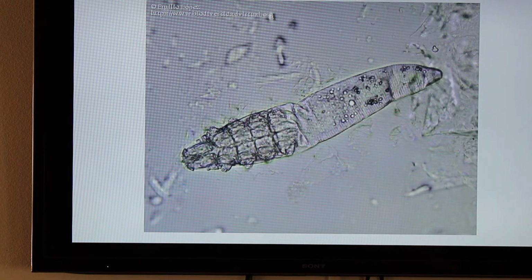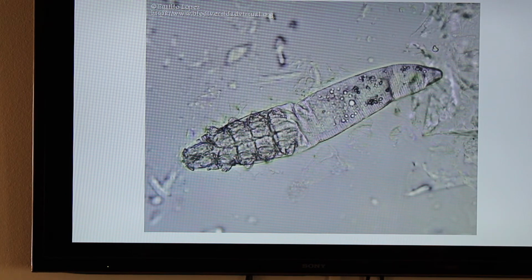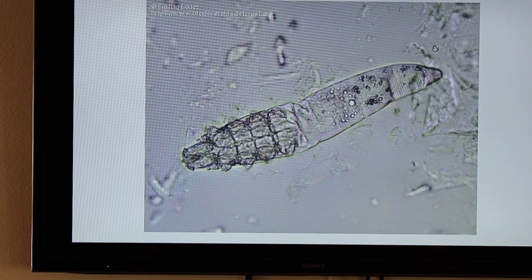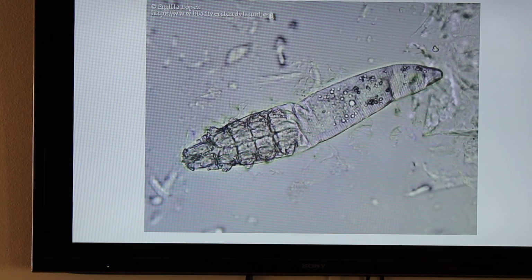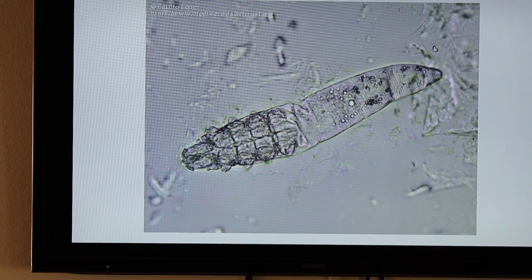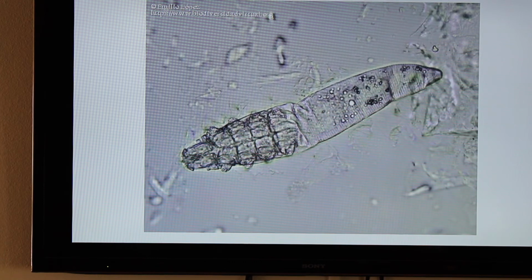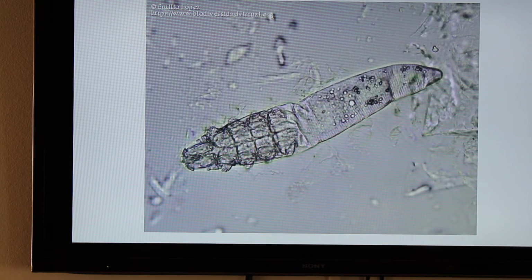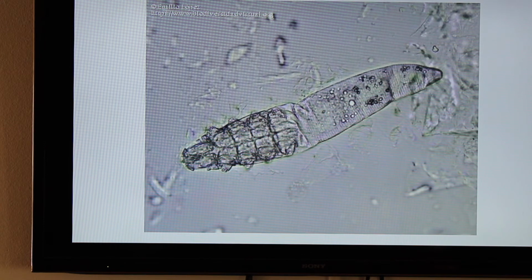This little guy here, it's alligator shaped, is a Demodex. We do have to do a deep skin scrape to actually get this diagnosis because of where it lives. So like a tape prep where you would get some other mites, you wouldn't necessarily get any Demodex because you really need to scrape deep in those follicles to get some of them out.